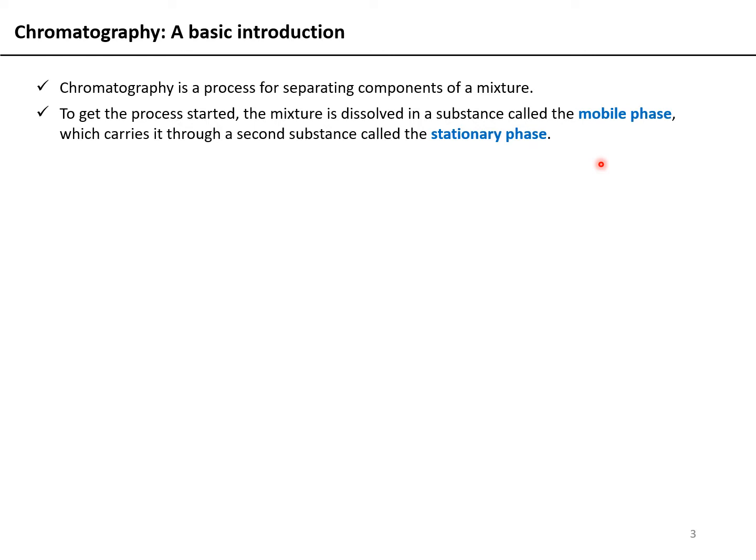So in the previous lectures, if you have been through them, we have been talking about these beads which we are going to use to purify our protein of interest out of the solution, utilizing either some tag which is added to the protein or its physicochemical properties. So these beads actually constitute the stationary phase because they are stationary, that is, they are not moving in nature. And on the beads you add your load, which is essentially the mobile phase because it moves through the beads or the stationary phase.